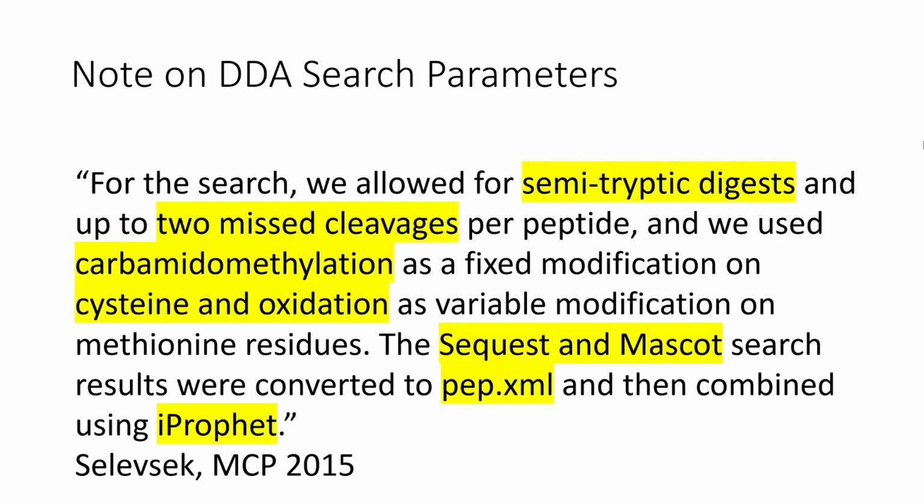But I've run these at home on bigger machines with the full semi-tryptic, and if you read the paper, it'll say our library includes this many peptides. And when I first did the analysis, I just imported it into Skyline with normal trypsin. I was like, well, I got 20% less than they have. And so it took me a while to figure out how to get up to the numbers that they were reporting. And that's partly because of these semi-tryptic peptides, which Ludovic Gillet, who's the guy at the Aebersold Lab who created the library, is pretty emphatic that, well, those really are in the sample.